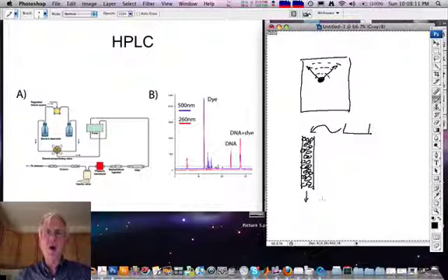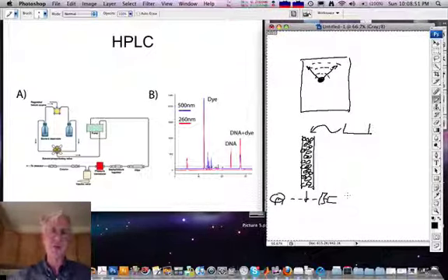In general, the more complex the reaction, the larger the number of side reactions, the more entropy is involved, and the greater the need for separating and purifying a product. The way that one detects that one has got what one hopes one has is to have some sort of detector here. It could be, for example, a light source that gives rise to fluorescence that's then detected through a filter on a detector. It could be ultraviolet absorption, and it could even be a measurement of just the refractive index of the solvent. Whatever it is, a series of peaks will occur at the detector as the reagents come by.